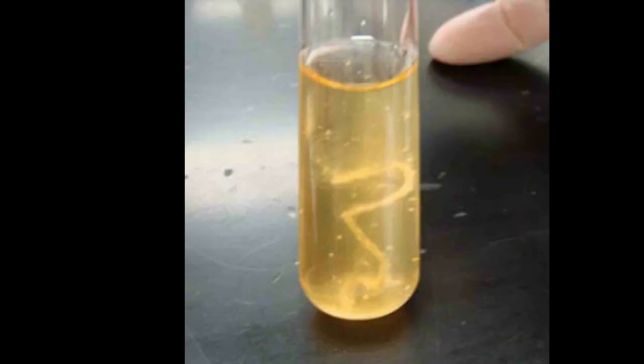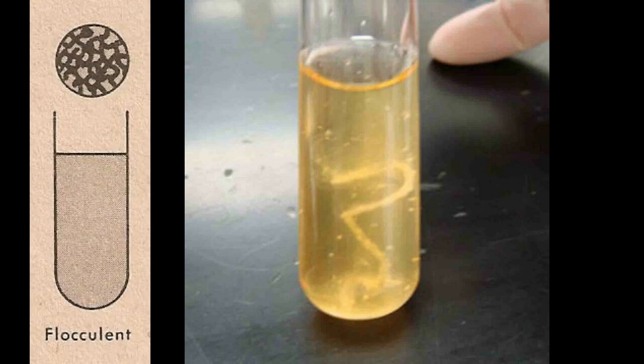Let us now characterize the sample. Note that the broth was swirled to show that it is flocculent. With that said, its surface and subsurface growth are both flocculent. The amount of growth should be moderate to abundant. Sediment is also flocculent, and its pigmentation is whitish.